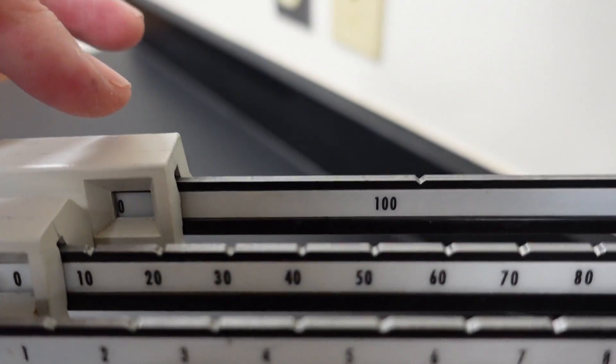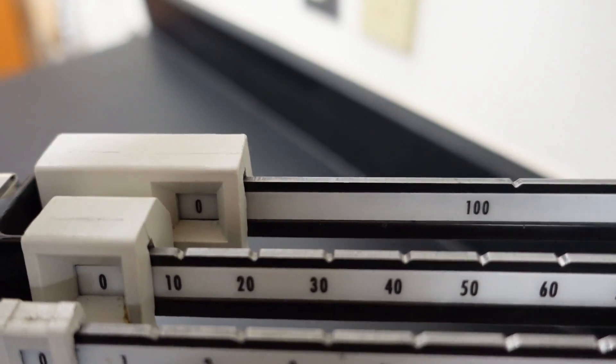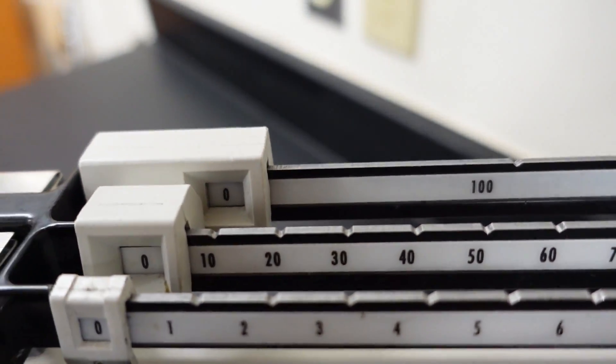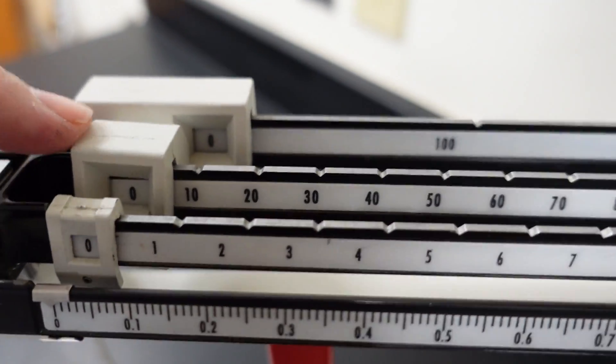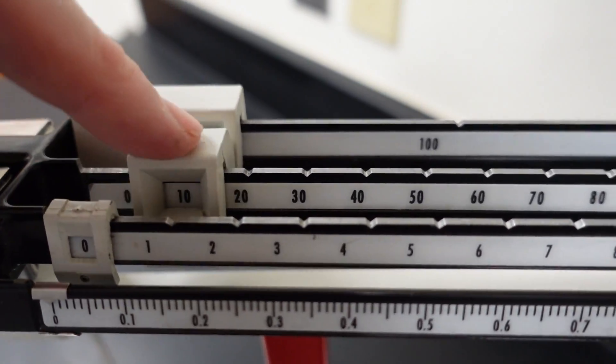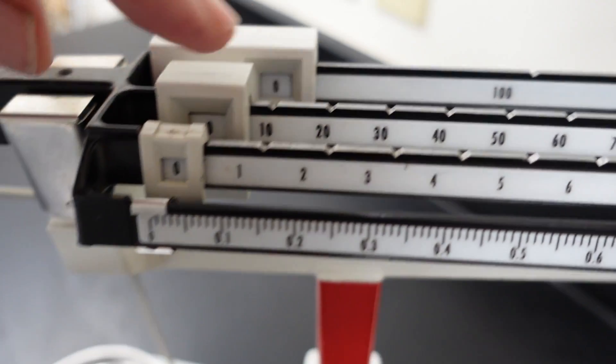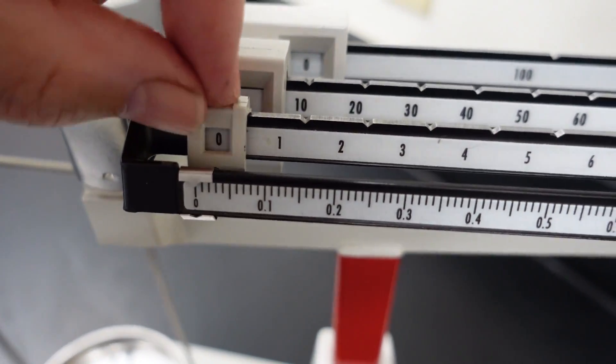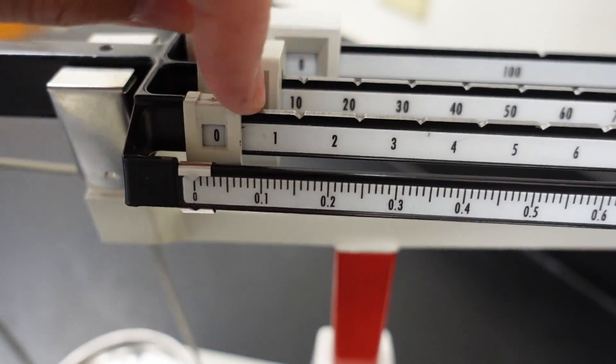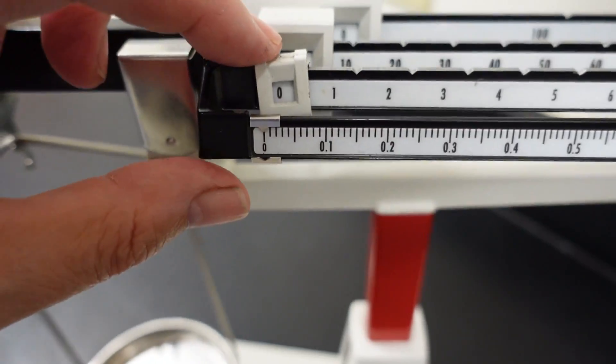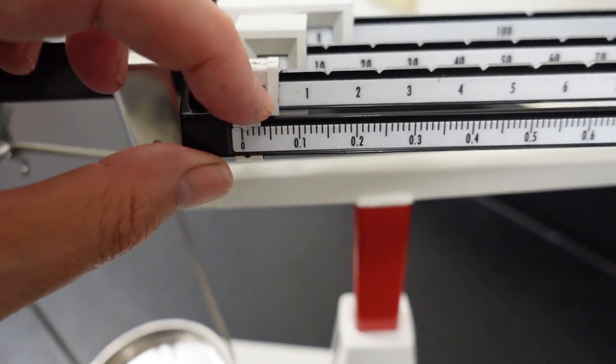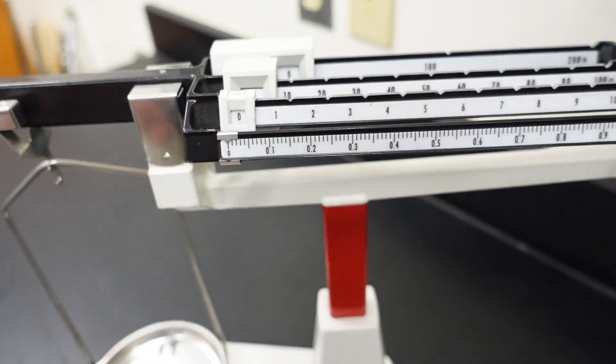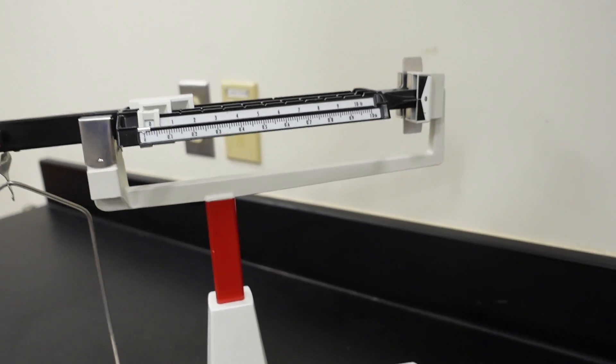This rider is the hundreds place. Oh, and it wasn't clicked into place. This rider is for the tens place. This rider is for the ones place. And, this rider is for the tenths, the hundredths, and the thousandths. Three places with just one slider.